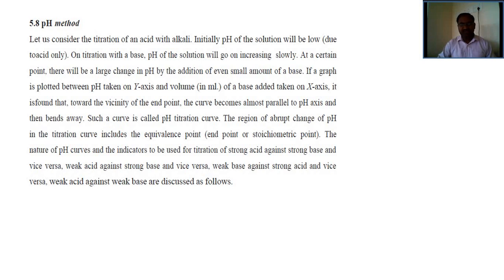From the pH method, how do we determine the concentration of unknown solutions? Let us consider the titration of an acid with alkali. Initially, the pH of the solution will be low.